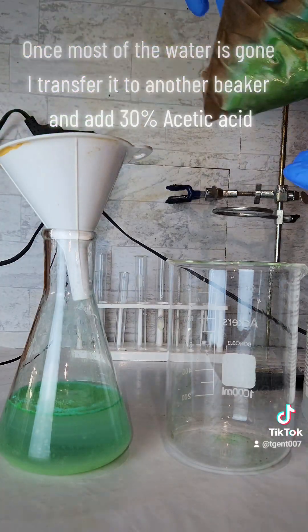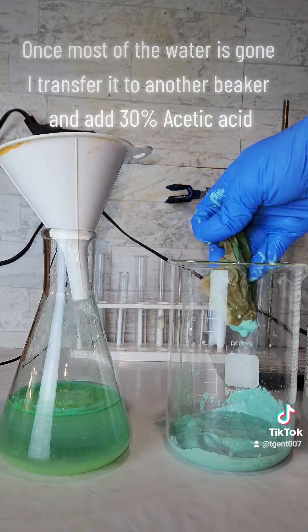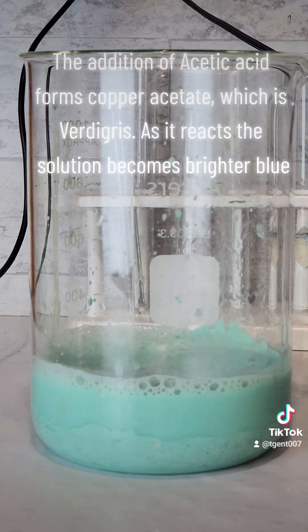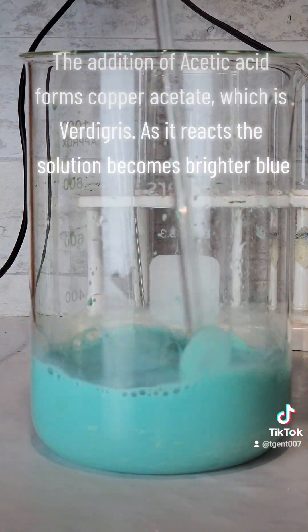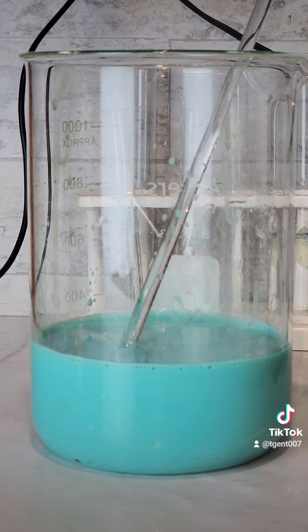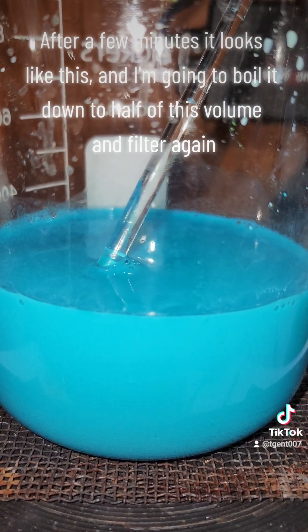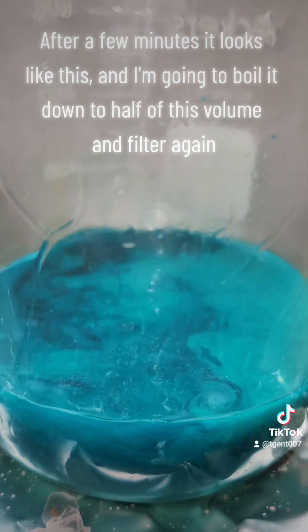Once most of the water is gone, I transfer it to another beaker and add 30% acetic acid. The addition of acetic acid forms copper acetate, which is verdigris. As it reacts, the solution becomes brighter blue. After a few minutes it looks like this, and I'm going to boil it down to half of this volume and filter again.